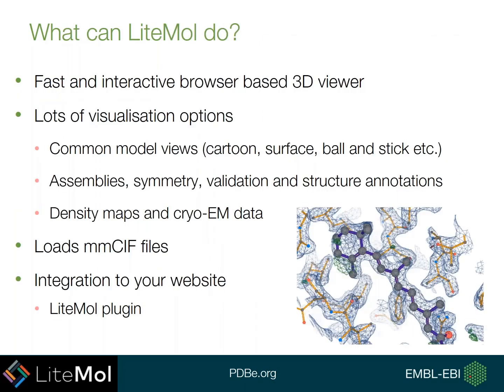So as I've said, LiteMol is fast, and it's also interactive, and you can use this within your browser very easily. There are a number of different options for visualization. So you can view polymers in the common model views that you'd see in other visualization software. You can view it in cartoons, surface, ball and stick, and other modes like this.